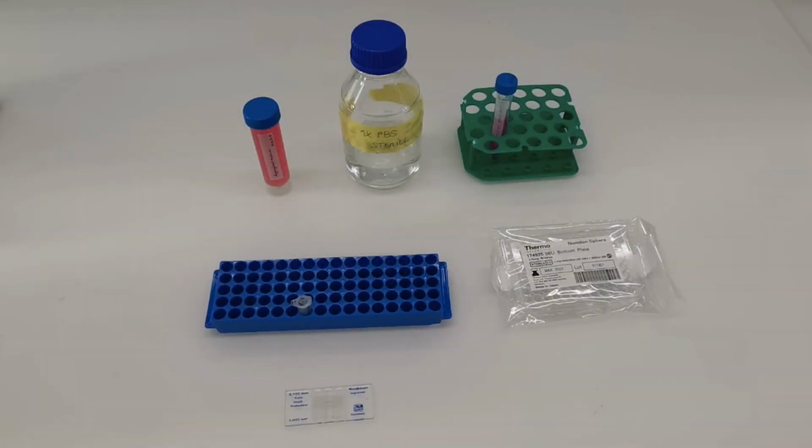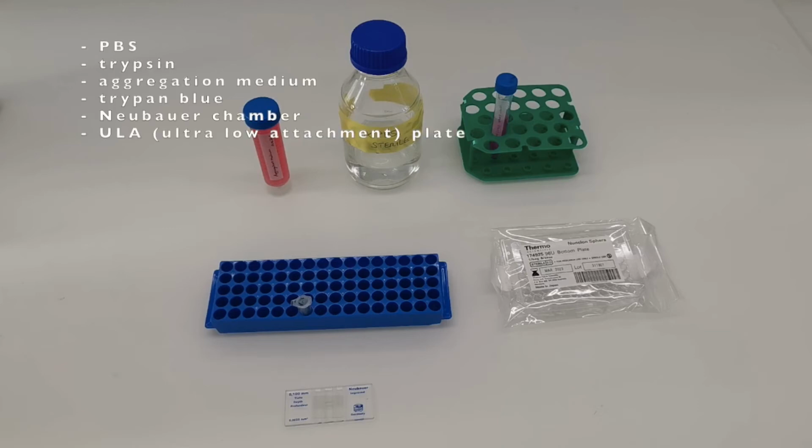Today we will show you how to generate 3D liver microtissues using ultra-low adherence plates. Before starting, you should prepare all the material you will need. PBS, trypsin and aggregation medium should be warmed at room temperature. The aggregation medium contains Williams E medium, Glutamax, ITS, 100 nanomolar dexamethasone, 20% FBS and 1% penstrep. You will need to prepare trypan blue and a Neubauer chamber for cell counting.